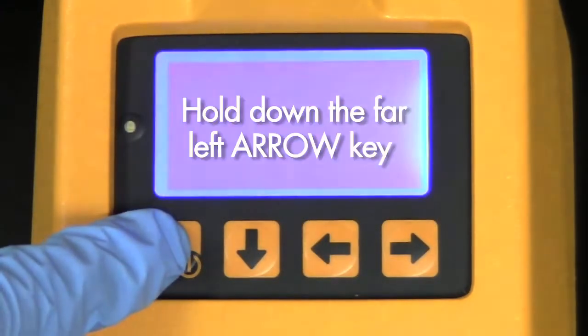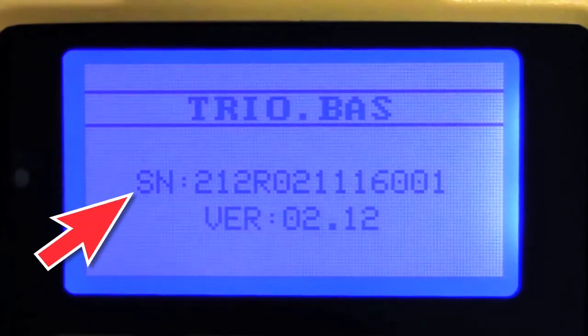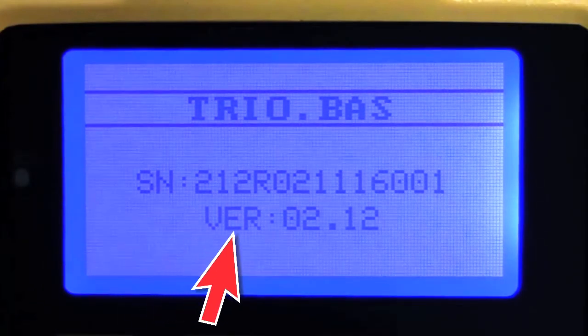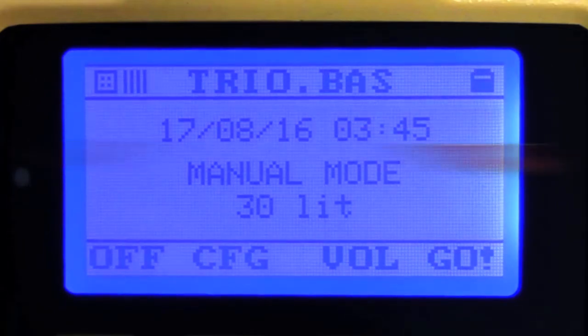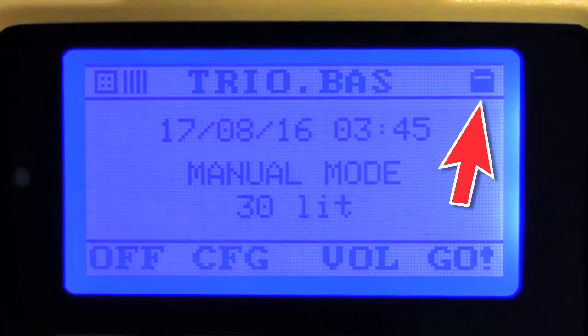Hold down the far left arrow key to switch on the unit. The screen will initially display the serial number and the internal software revision number. Next, the date, time, mode, and airflow rate of the instrument will be displayed. Battery life is displayed in the upper right corner.